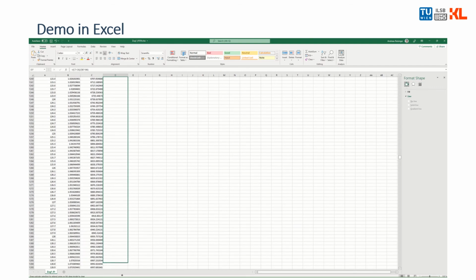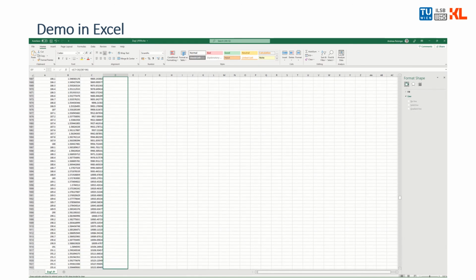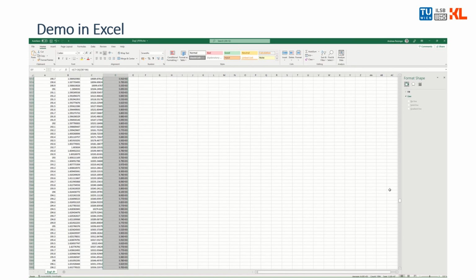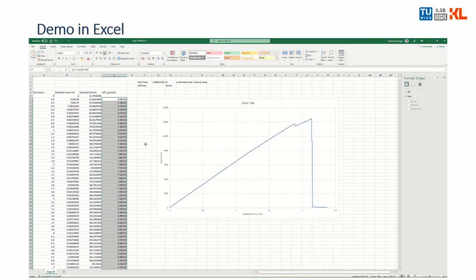You see in the center column, I'm now at 1 millimeter. So let's stop. So go until 2000 points. I think that's a good border. Line 2000. Okay. So this is the slope between all the data points, and let's plot this.